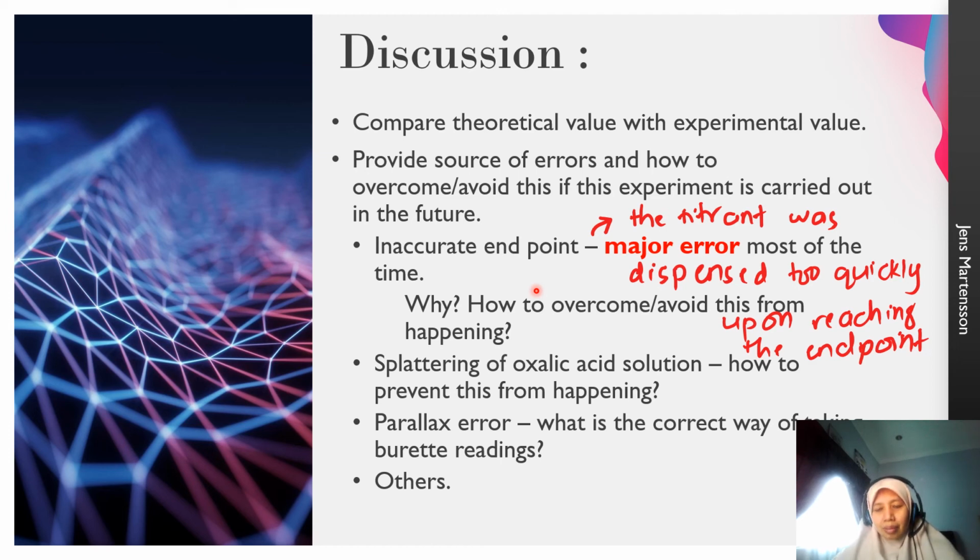Why? Because maybe students cannot control the stopcock in the right way. Hence, the titrant was dispensed too quickly. And of course, you added excess titrant, which is more than the endpoint.